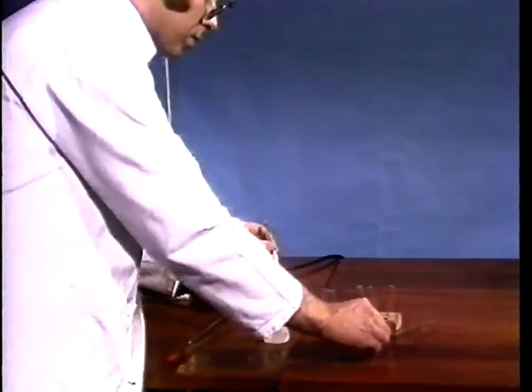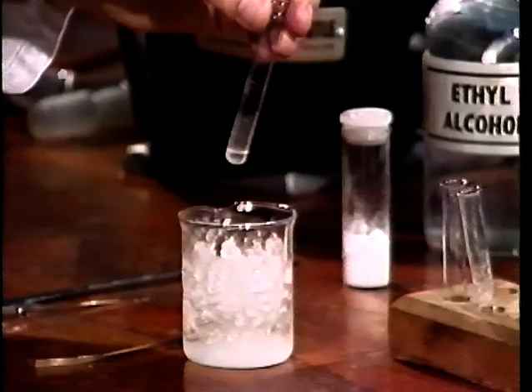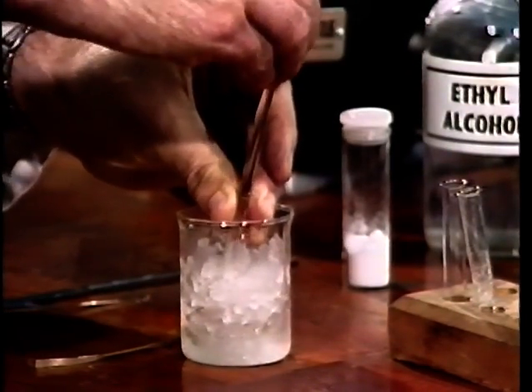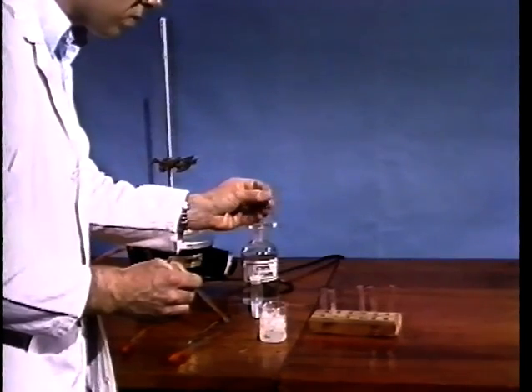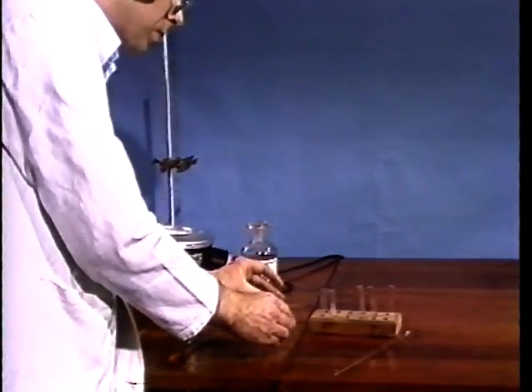If crystallization does not occur quickly, the process may be hastened by scratching the inside of the test tube with a glass rod whilst cooling the mixture. If the solid crystallizes after this process, then this solvent is useful for recrystallization.